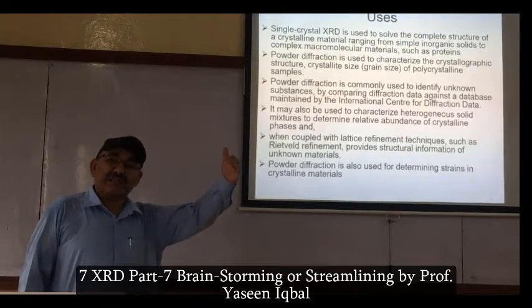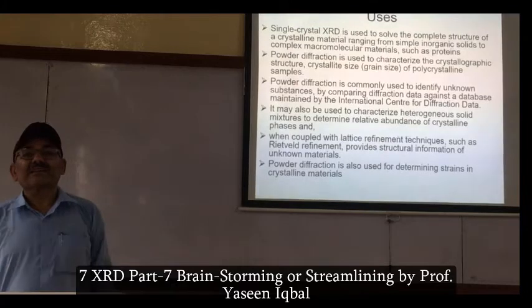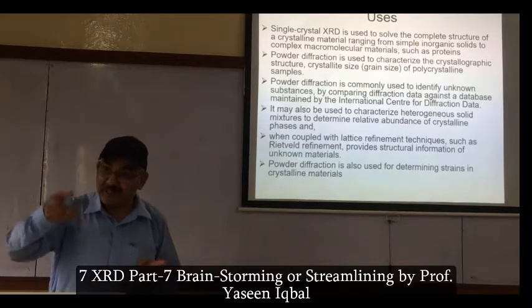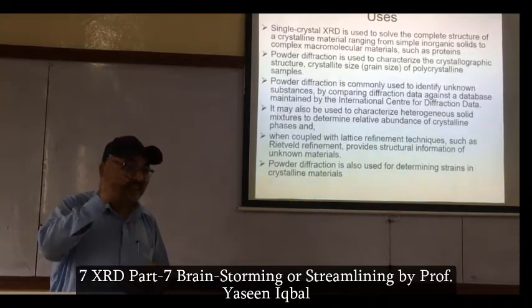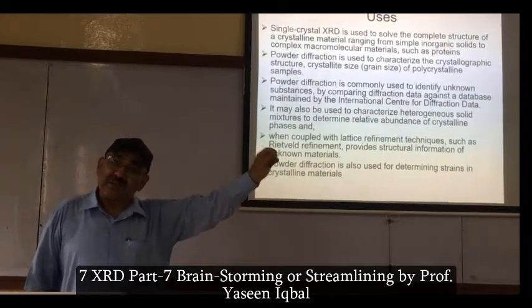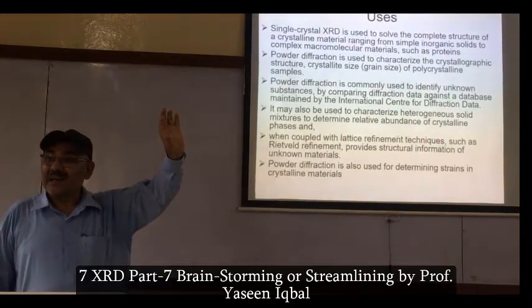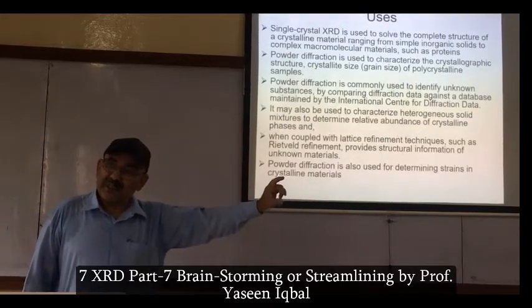And when they emit X-rays, those X-rays are then used to know about the elemental composition, not oxide composition. Elemental composition, because the X-rays are coming from an atom, and an atom is not an oxide, right? An atom corresponds to an element.